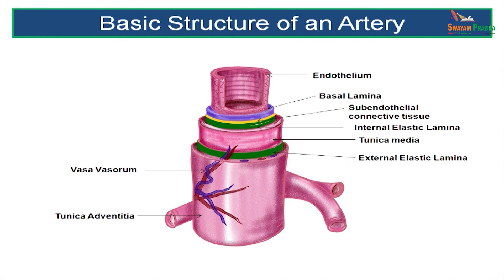Here we can see the basic structure of an artery. The innermost layer is an endothelium made up of a single layer of flattened or squamous cells resting on the basement membrane, also called the basal lamina. The yellow tissue here is the subendothelial connective tissue. The green coloured layer is the internal elastic lamina. These four layers — endothelium, basal lamina, subendothelial connective tissue and internal elastic lamina — form the tunica intima.